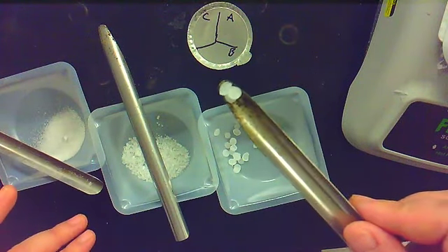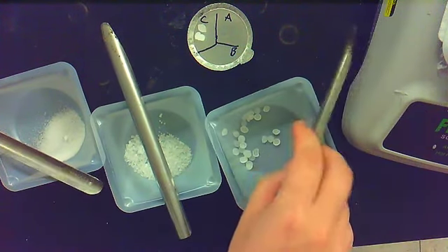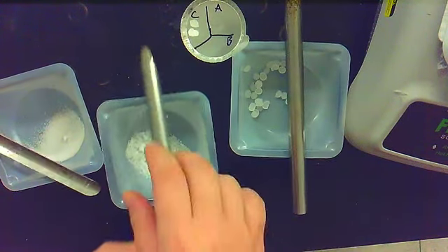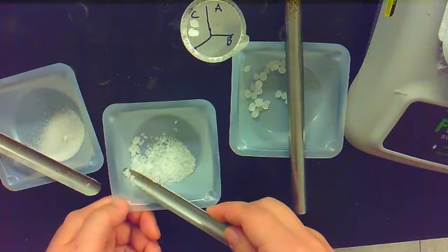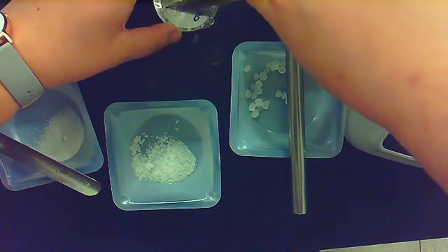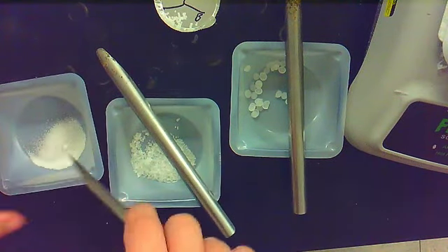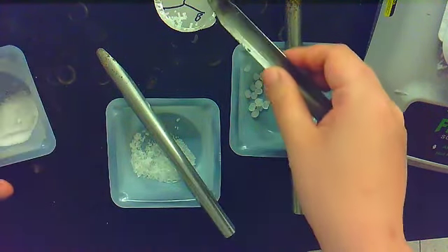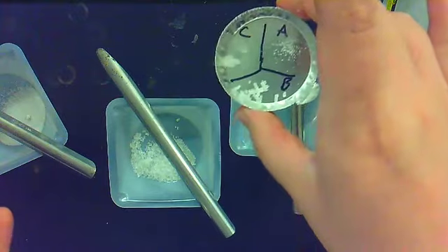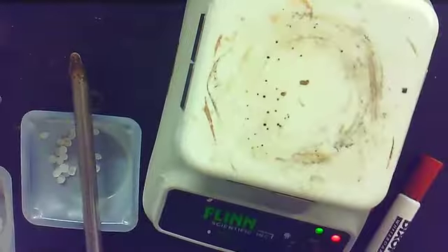So just like yesterday, what we're going to do is we're going to put these chemicals on a little plate, right? And heat these chemicals to figure out what their melting point is going to be. Okay? So I only need a little bit. So let me do that. No, it's fine. Just getting a little bit of each chemical on there. Okay? So, there's that. Let me set my camera up so that we're looking right at the hot plate.